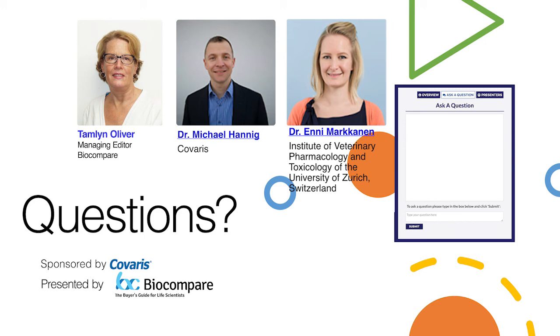Yeah, thanks for the question. The benefit, what you also have seen in my introduction, is really the deparaffinization of an FFPE sample, and within an LCM sample, of course, it's the additional benefit that we rehydrate the tissue also and make it then later accessible for the digestion.